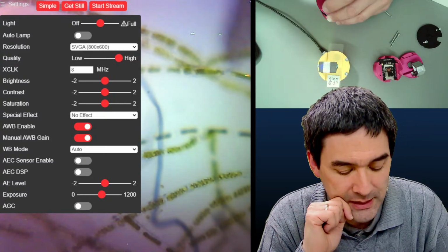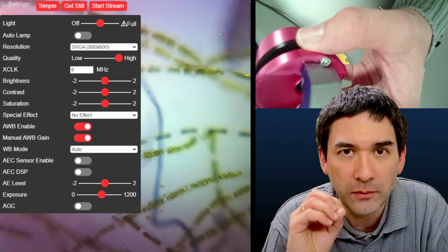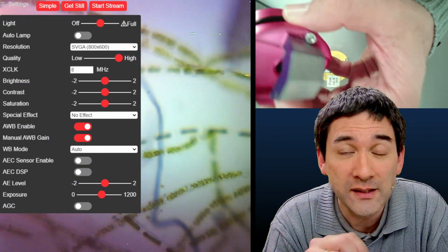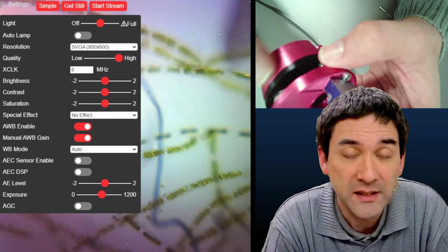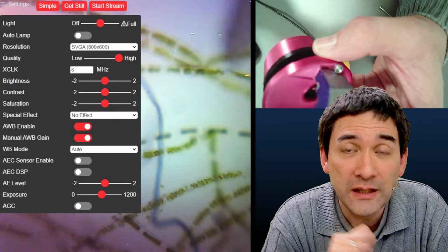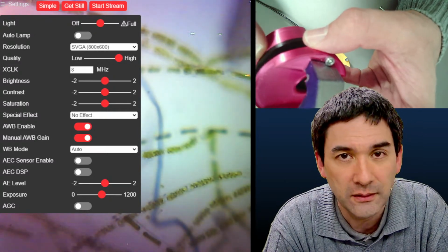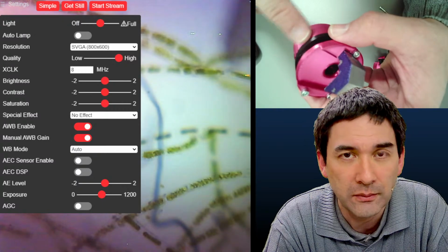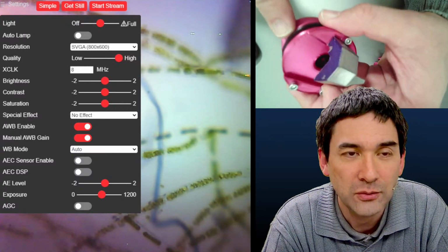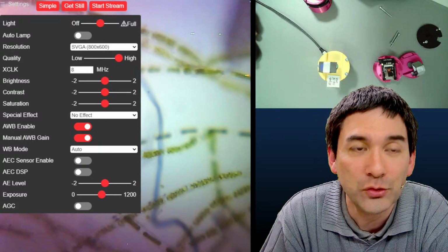You basically turn on the microscope, and then on the wireless, even on the mobile phone, by the way, you will see that there is a new wireless router. So this basically creates a little access point. And then you simply type in the internet address, which is a number. It's all in the documentation. It's the IP address, which is always the same. And then you can access this little control panel over here.